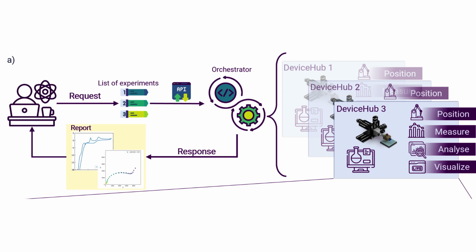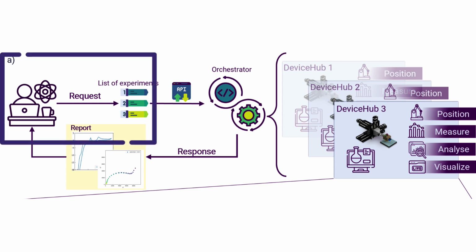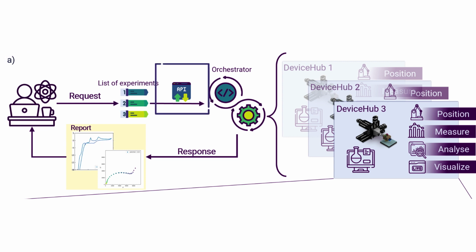Before we start, I would like to outline the overall workflow of this modular framework. Initially, the operator configures his experimental setup and schedules one or multiple batches of experiments through a user-friendly interface. Once configured, the batch requests are transmitted to a Python backend via Flask, requiring no further user intervention.